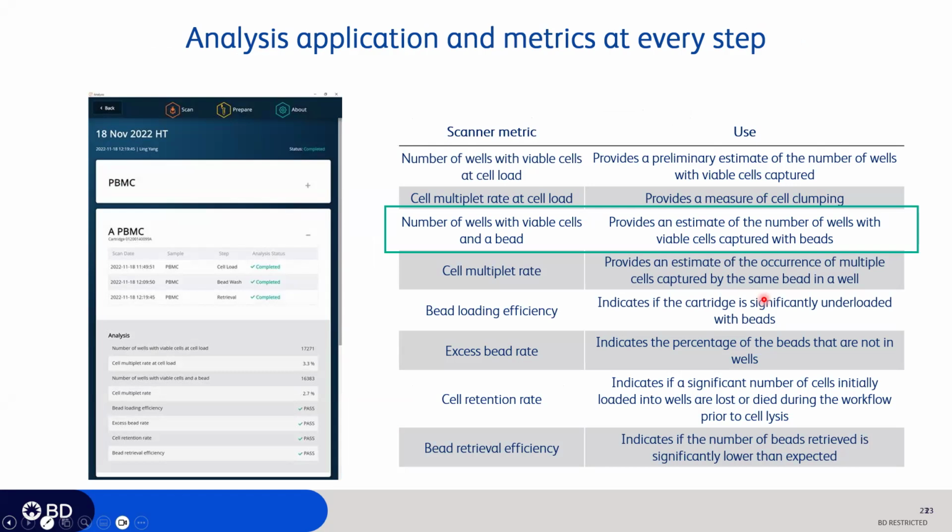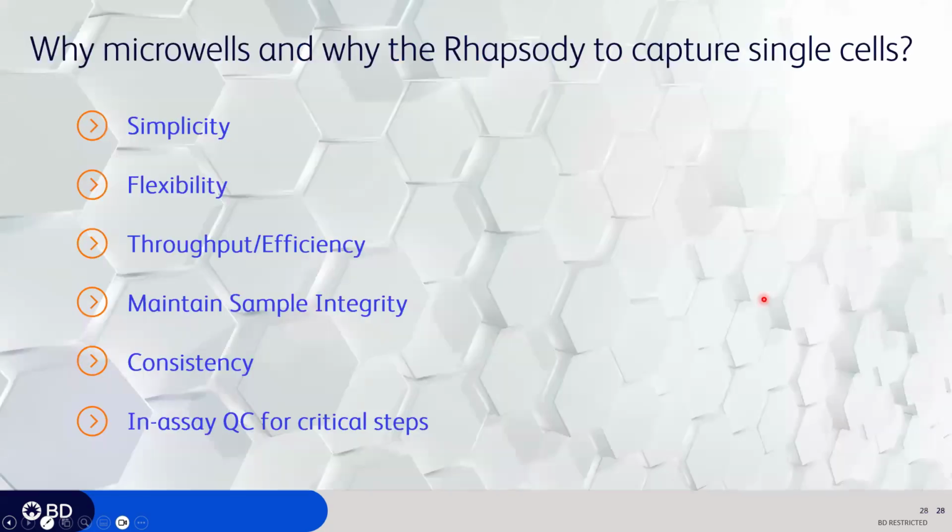This is going to tell you how much sequencing total you need for that experiment. And it will also give you an idea of how many cycles you need to adjust your library preparation reactions. So really helpful here.